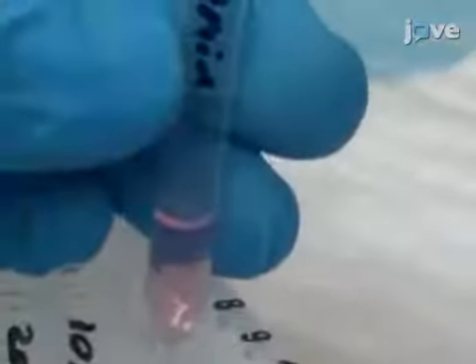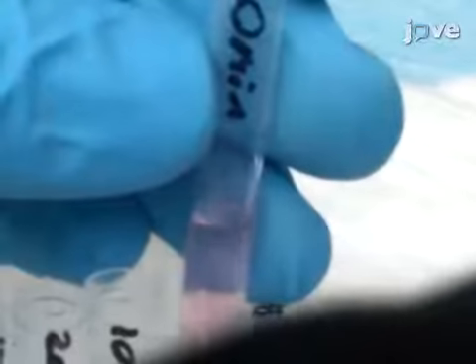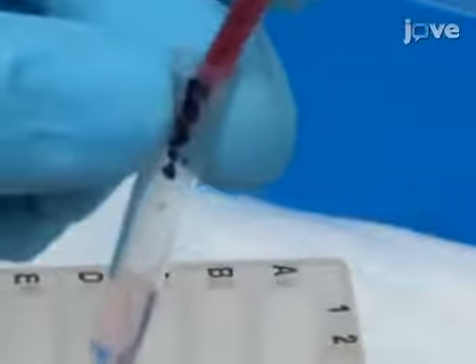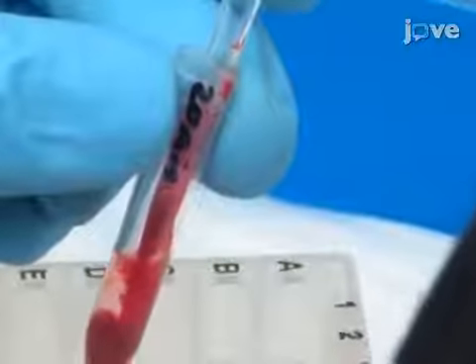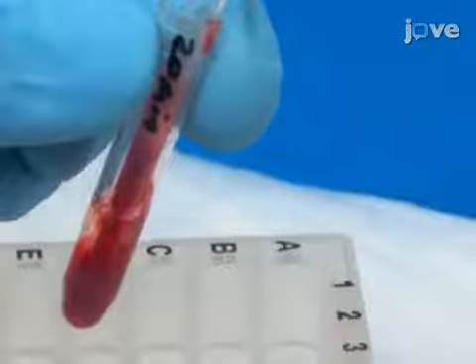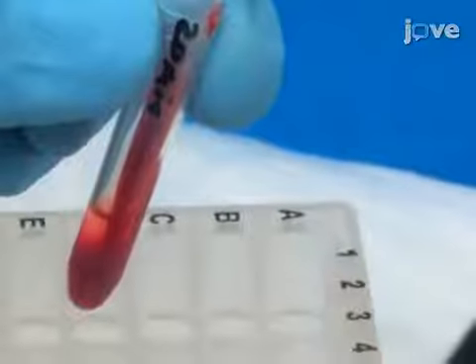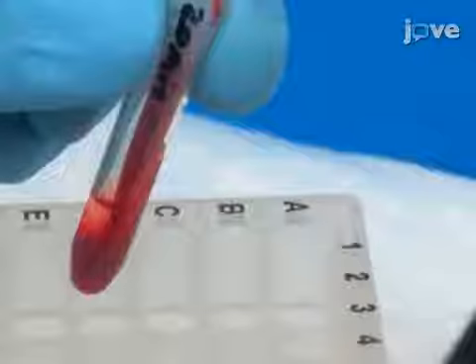Then add 40 microliters of the thawed DHE to each tube containing the bioparticles and gently tap the tubes on the bench to collect the reagent in the bottoms of the tubes. After adding 100 microliters of mixed whole blood to each tube, remove any contaminating blood along the inside edge of the tubes with a cotton-tipped applicator and mix the blood and reagents with an electronic pipette set for 3 cycles.